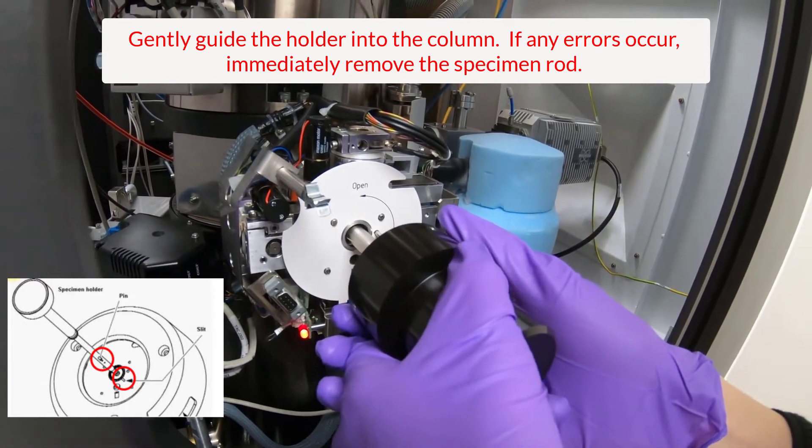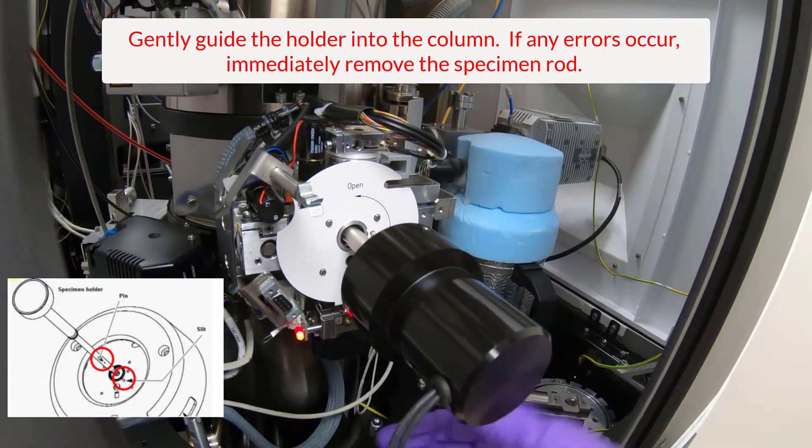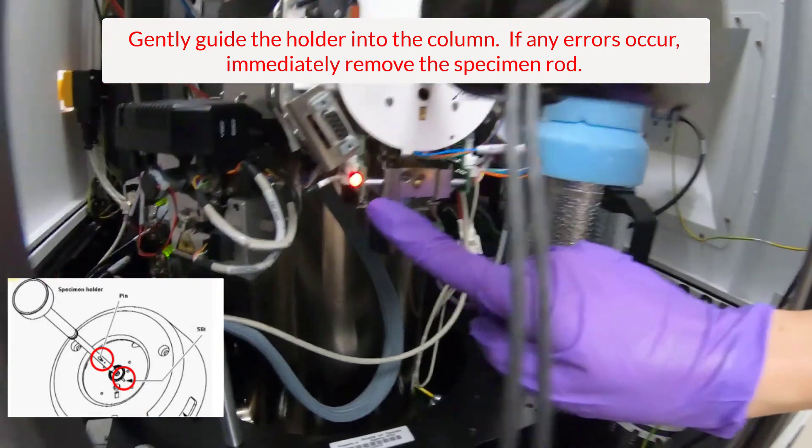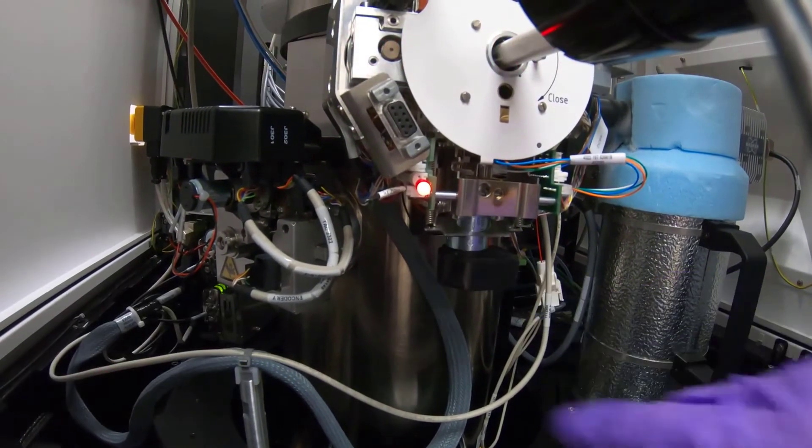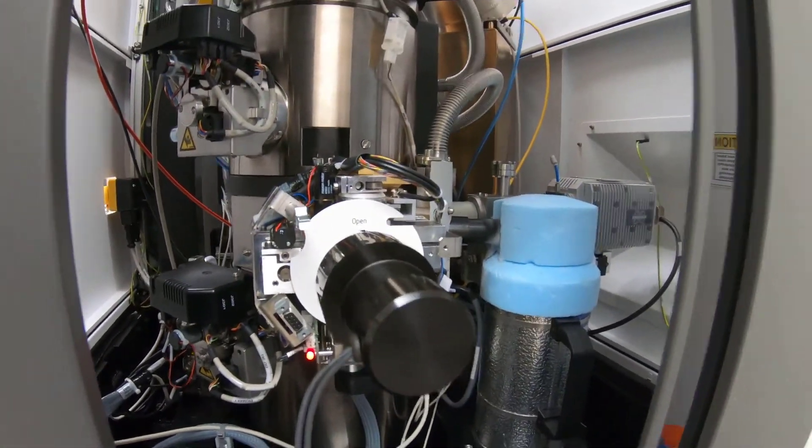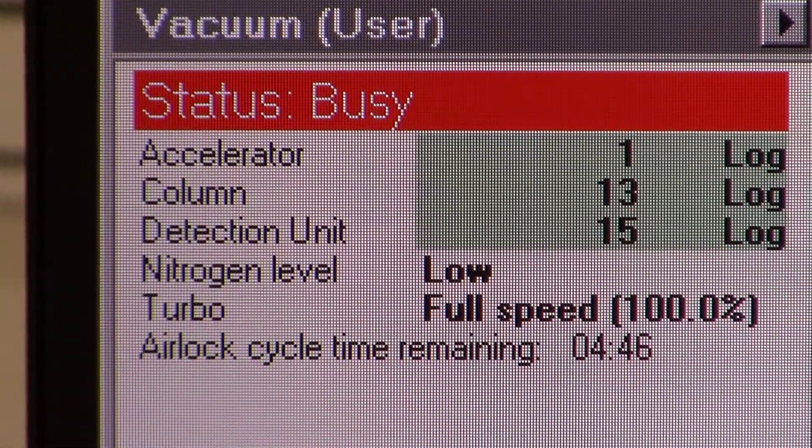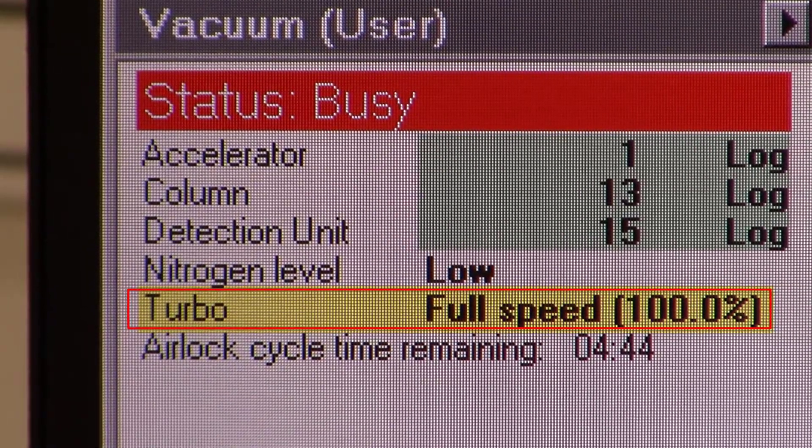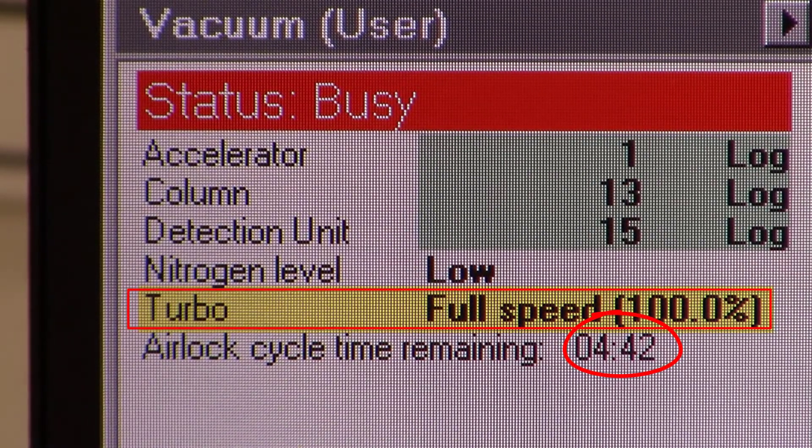You will be able to feel if the pin is lined up correctly inside. Once it is, gently push to seat. The red LED light will turn on and the turbo will ramp up. Once the turbo is at 100%, a 5-minute countdown will appear in the user interface.